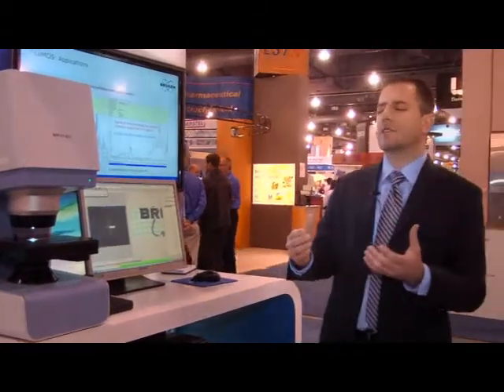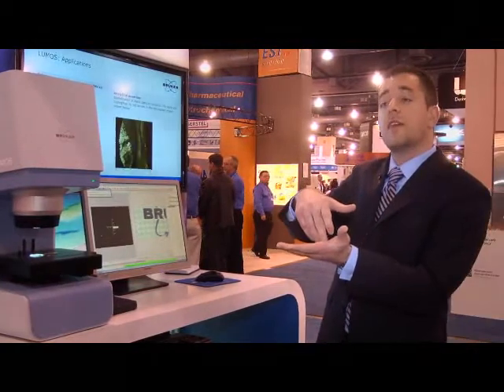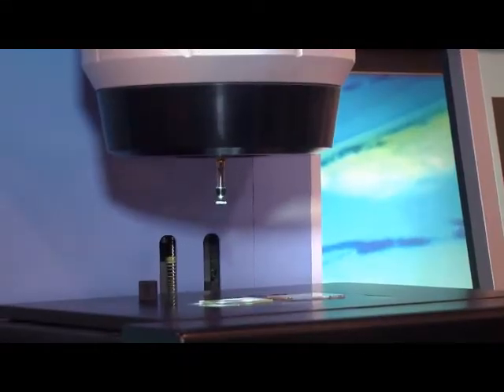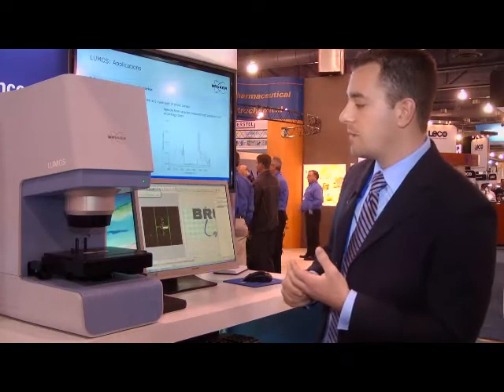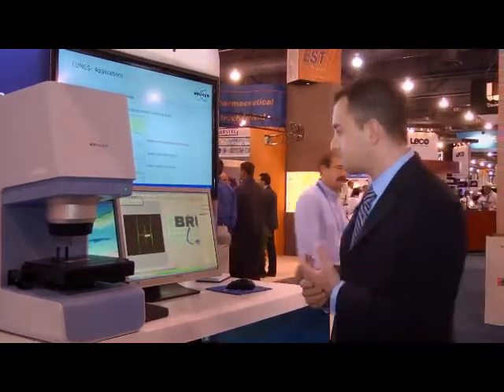And what ATR does is it literally comes down and touches the sample spot, and that's how you get your infrared analysis. So as you can see, when I went to take my background, the stage lowers automatically. And you can see one of the biggest unique features about the LUMOS is the automated ATR. That ATR objective is just like an anvil. That spot is about 100 microns in diameter. So the infrared beam clips it, and we're able to take our background completely automated.